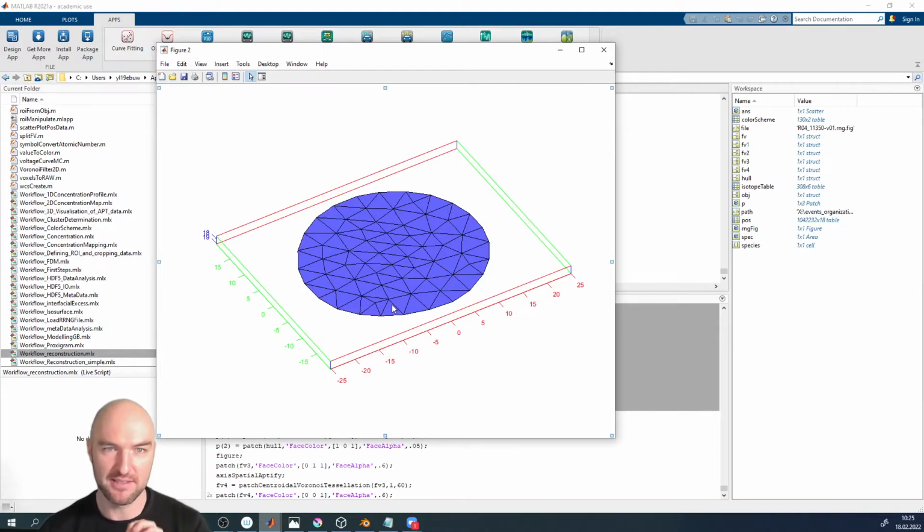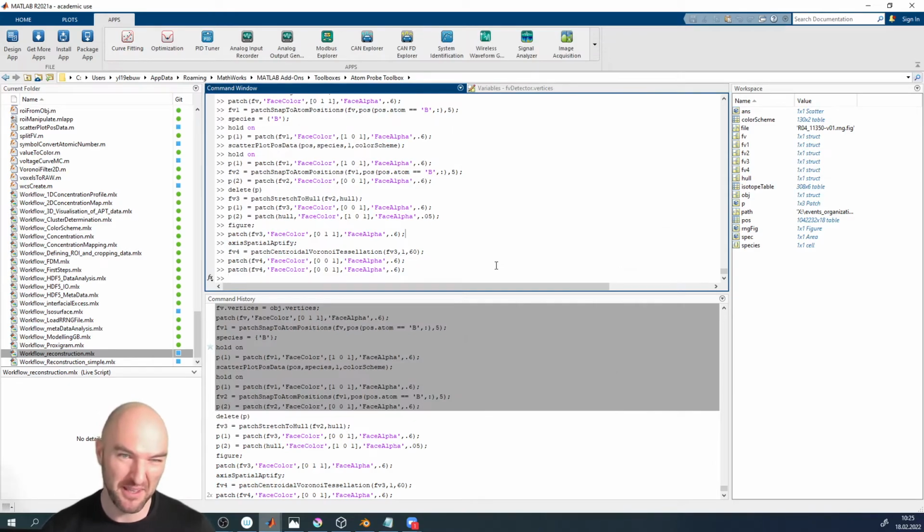So if that's something that bothers you, you might go back into Blender and just delete that vertex, just get rid of that topologically trapped vertex. It can be an issue. It isn't necessarily an issue.